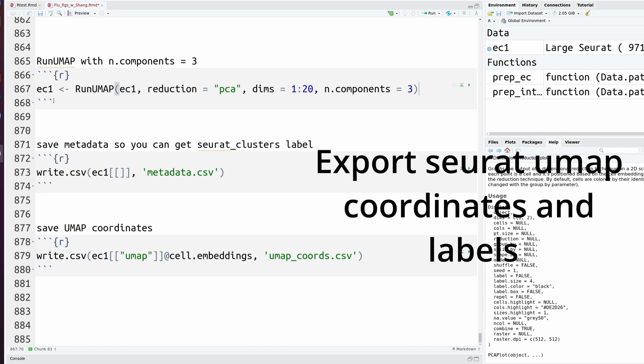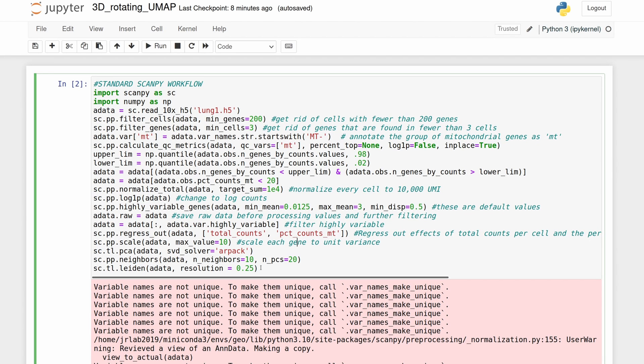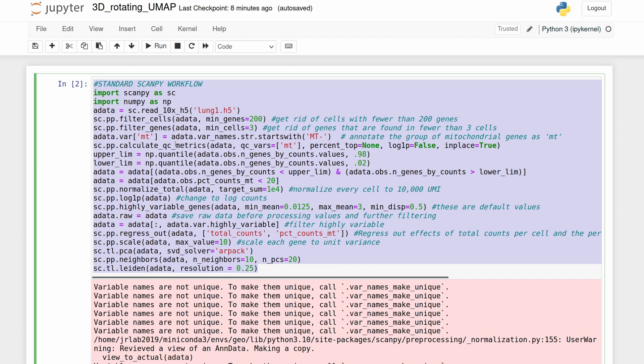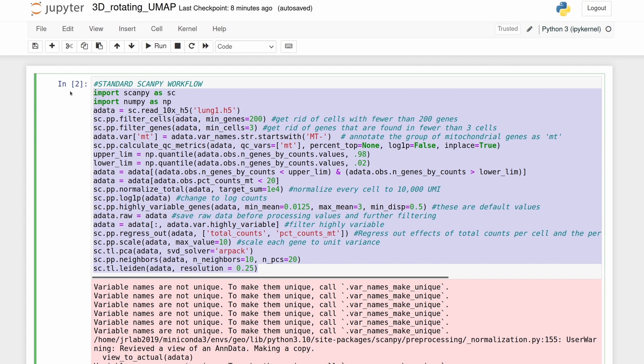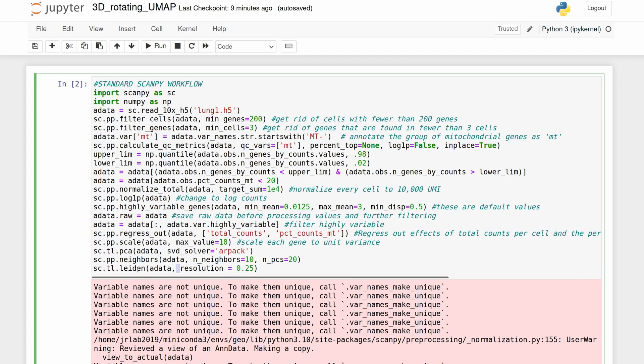If your analysis is in R with Seurat, you really only have to do three simple steps. So I went ahead and just ran the standard Scanpy workflow on some lung data. I'm not going to go over this, I have another video that does, if you don't know how to do this. Just one important point is I used the Leiden algorithm to label clusters.